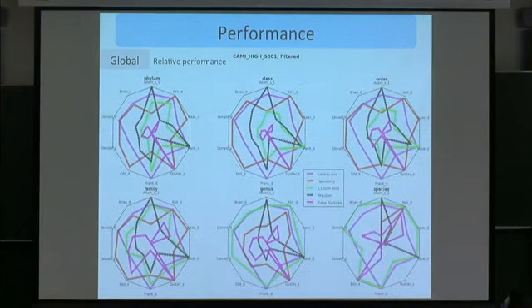Okay. High complexity sample. Squiggliness of all these lines communicates the wild differences of performance between the different metrics and across the different methods. So for instance, if you want to look at the number of false positives, notice that some of these have very high, some of these have extremely low, some of these have medium, and so it's just all over the place.